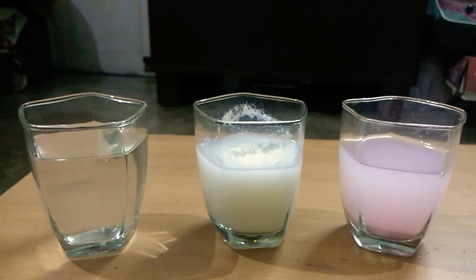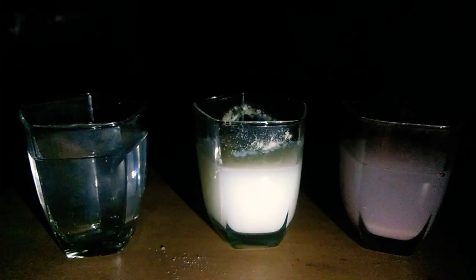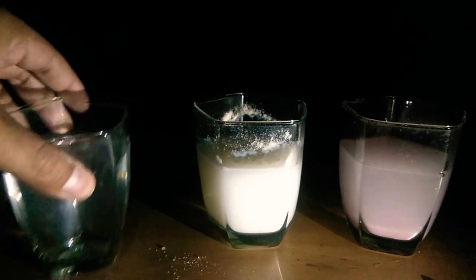So when light spreads, then you can see the path of light, and that is called scattering of light. Now I will show you whether light gets scattered by solution, colloid, or suspension. So I will switch off the light.